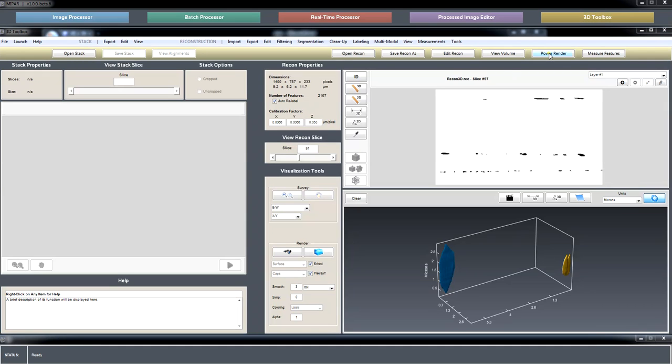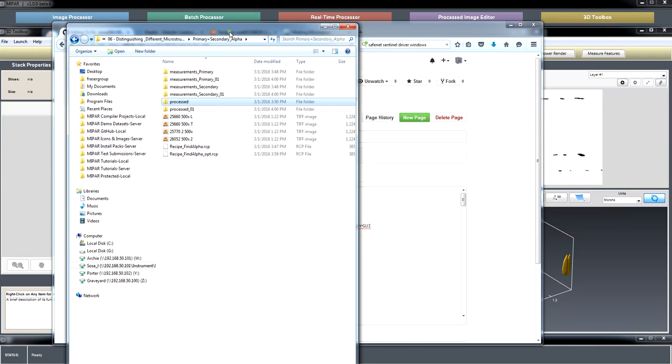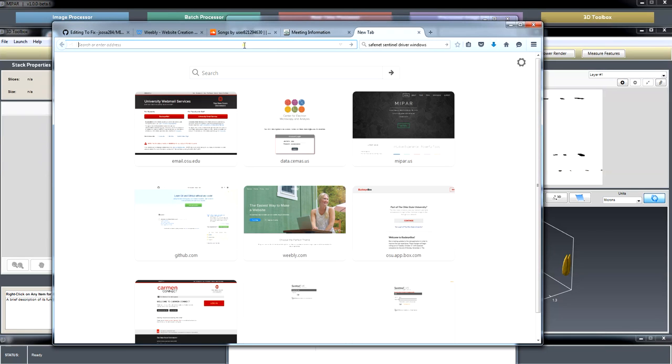You can check that date, and you don't need an internet connection. It would help, because then you could go to the activation page through the website. But if you still have your install instructions from the install pack, then you can also click on the activation page link inside of those instructions.